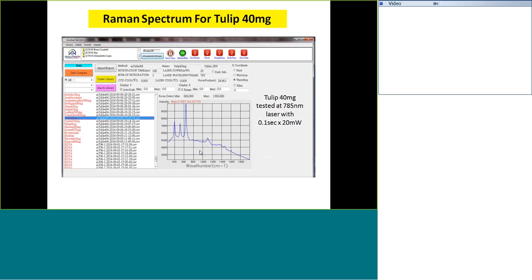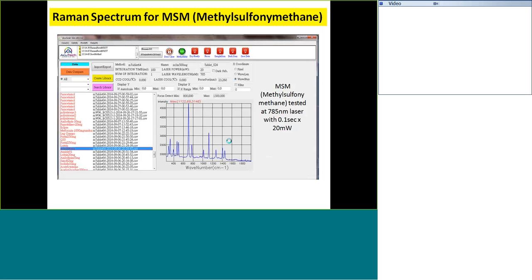Okay. And then you compare the same intensity under the same conditions, then it'll be the same. Just compare the same conditions: the power, the scanning time, the number of scans. Even if you enter those numbers in our table, then the computer software will calibrate there for you.